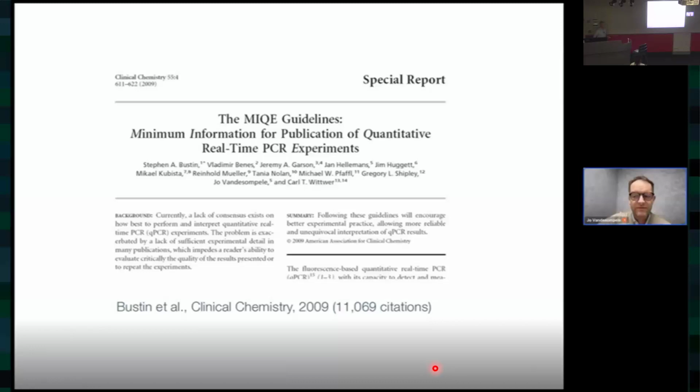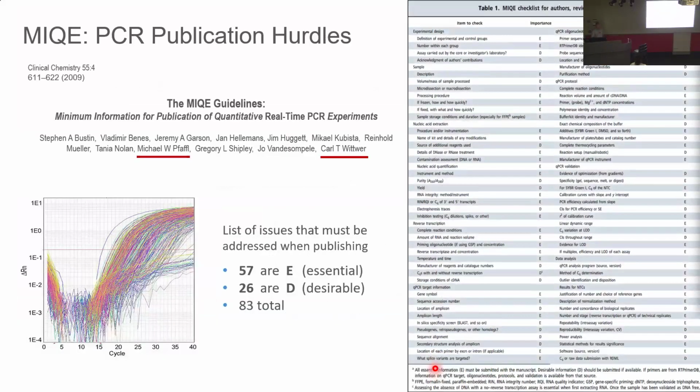So back to Joe van der Sompel and his talk. In his talk, he brought up the MIQE guidelines. Everybody knows the MIQE guidelines, a few nods. These are things that, it's a list. Here's the list of things. This is my slide for it.